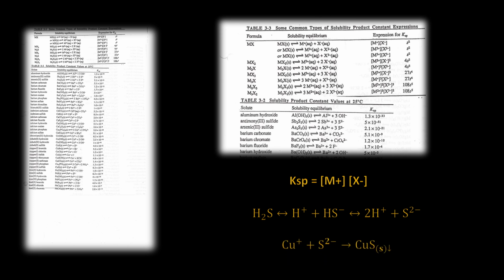Any copper in solution will combine with a sulfur in solution to form copper sulfide, as shown, where we have a copper atom and a sulfur atom combining to form copper sulfide as a solid, which is a precipitate. Since sulfides are insoluble in a sulfide solution, they will precipitate. Those sulfides that have higher Ksp values will stay in solution. That is, if the chloride solution is of the right pH value and of sufficient concentration to keep all remaining elements in solution as ions.